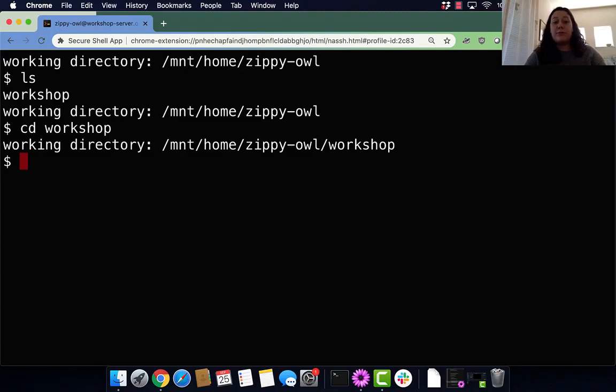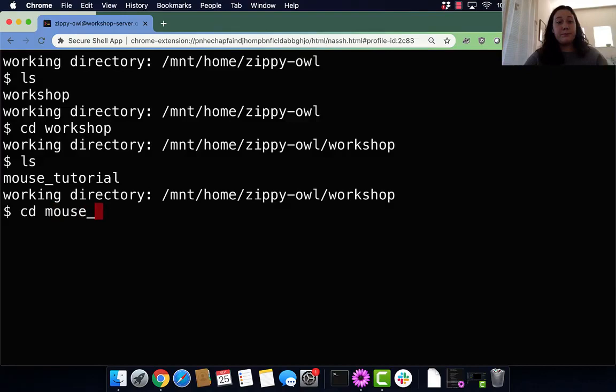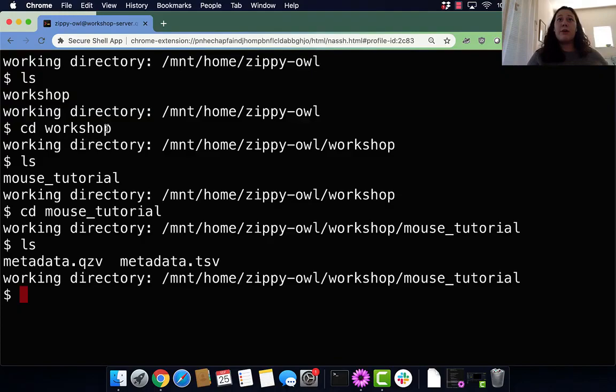So I cd'd into the workshop directory, which means I changed directories, and then I'm going to ls. I can see my mouse_tutorial directory, which you should have made in one of the previous sections of the tutorial. I'm going to cd into that mouse tutorial.